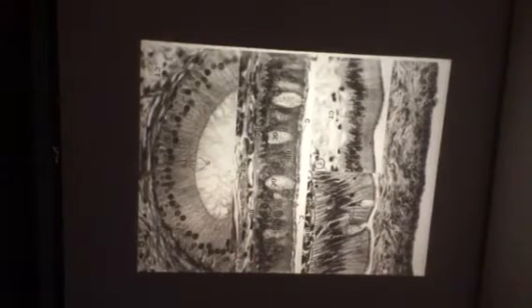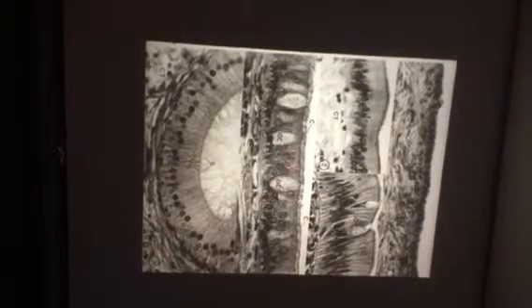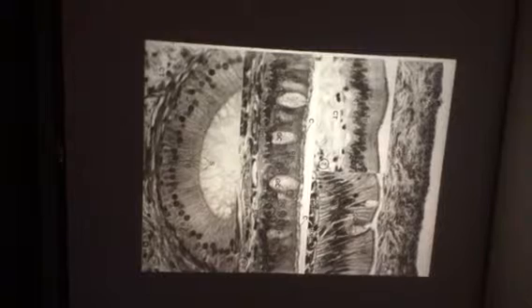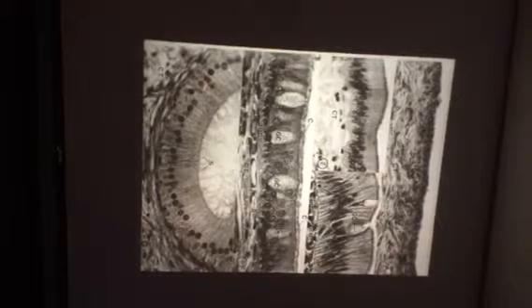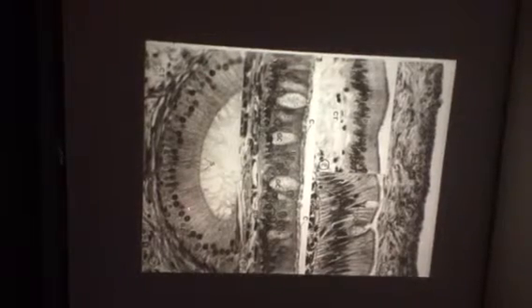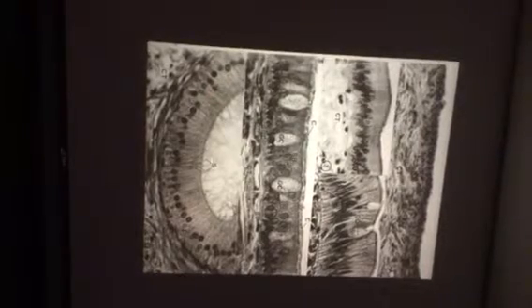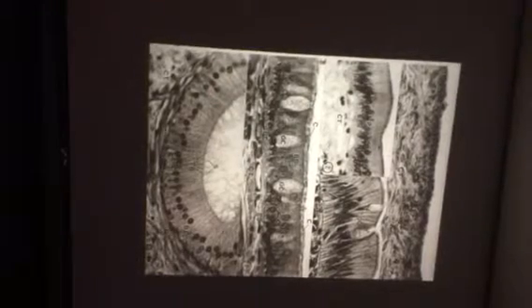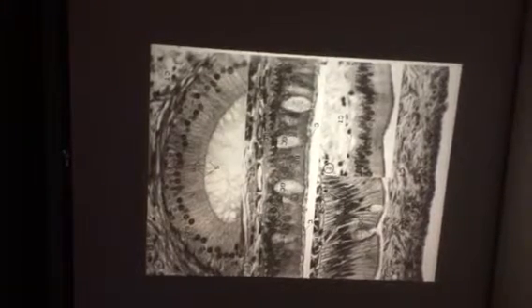In the next lecture, we'll talk about the different cells besides the columnar ciliated cells and the goblet cells that are resident in this particular type of epithelium. This is also pseudostratified columnar epithelium. This comes from the epididymis. It does not have cilia. It has stereocilia. You said basal lamina instead of basement membrane. Basement membrane. Basement membrane.